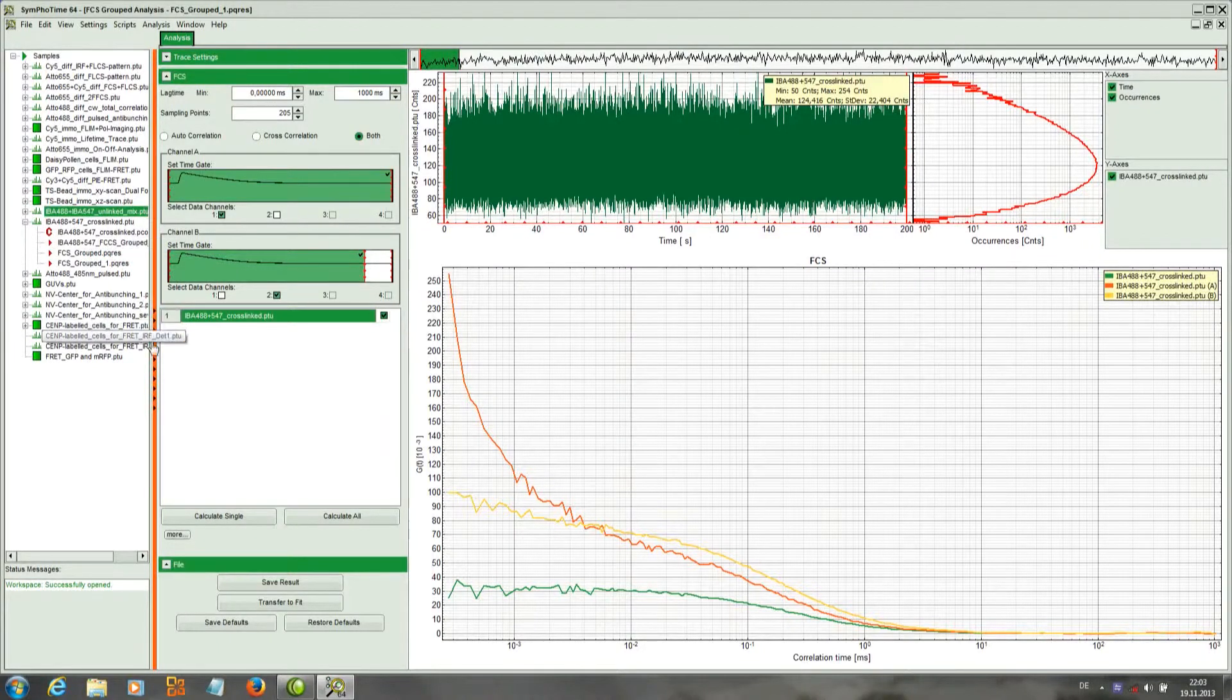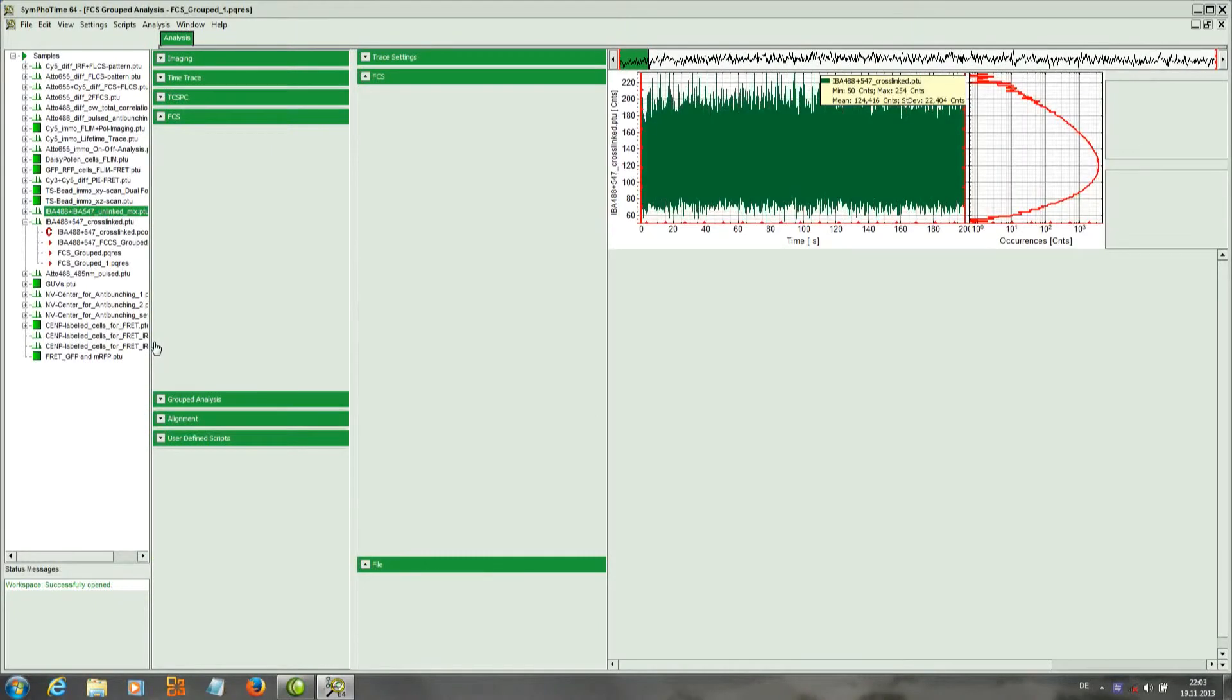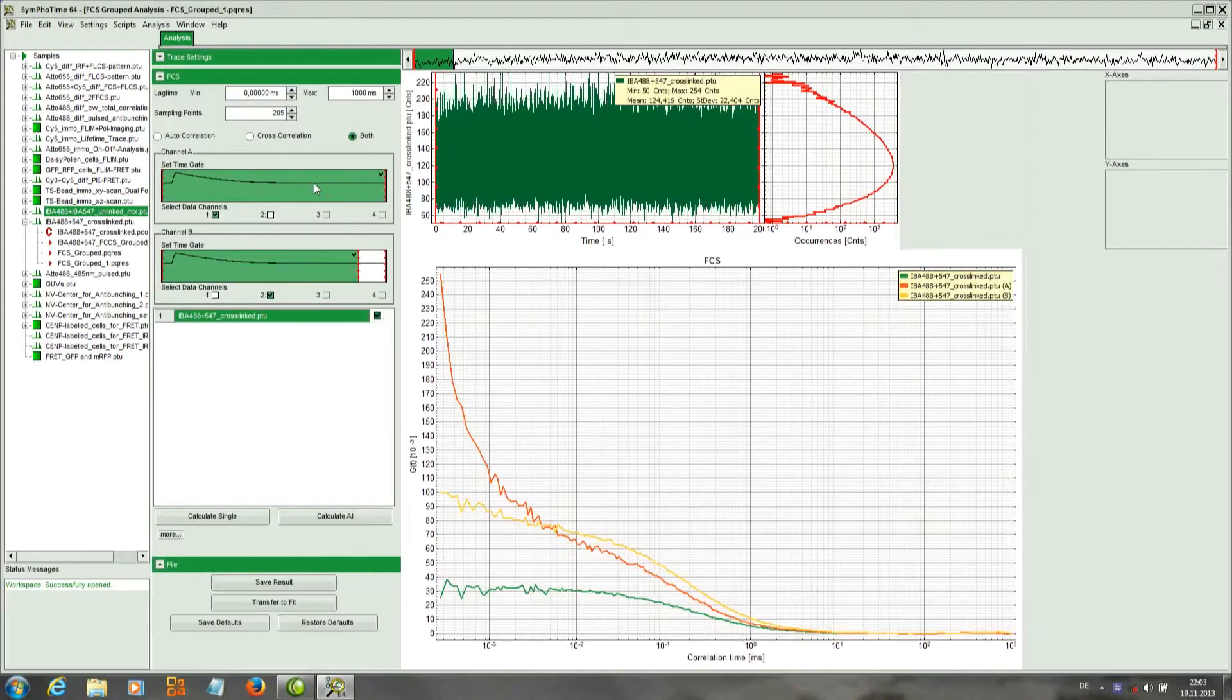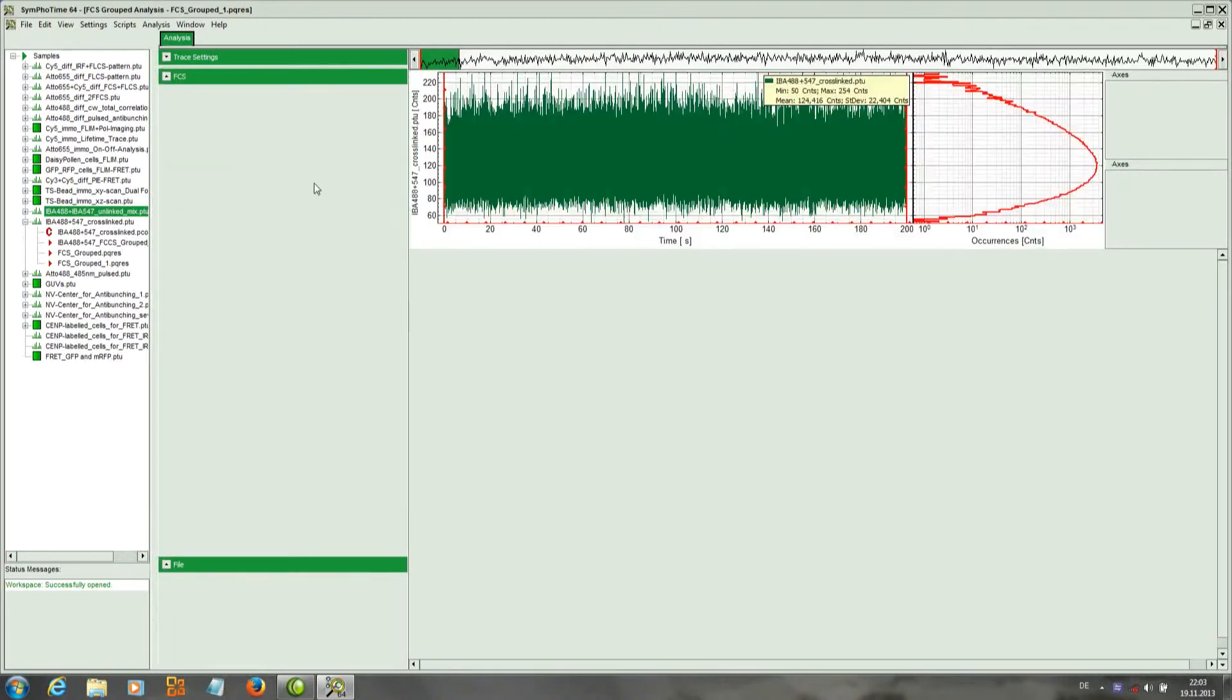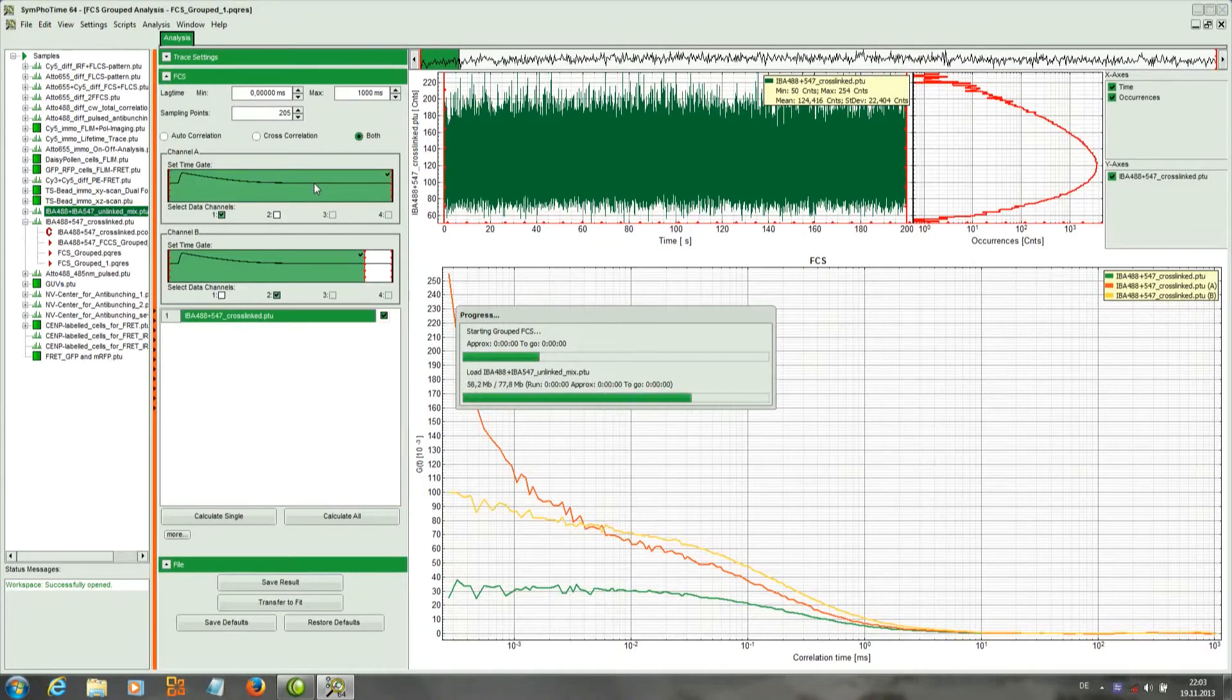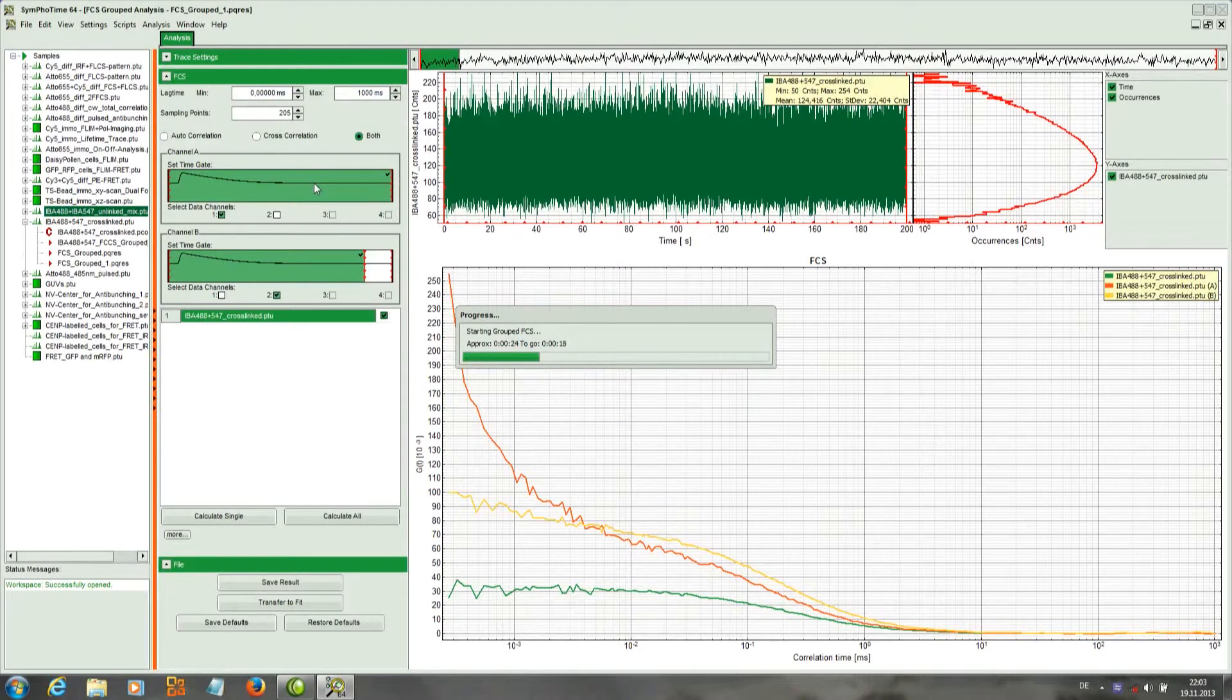We open another file again with the grouped FCS script. This second file contains the same dyes, but now on two different oligonucleotides. They are not cross-linked, they are moving in an uncoordinated fashion.